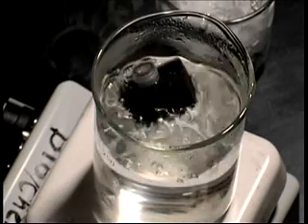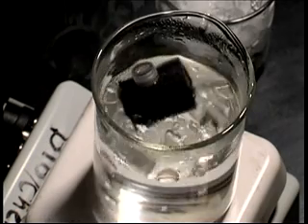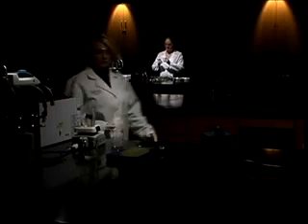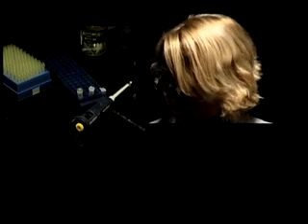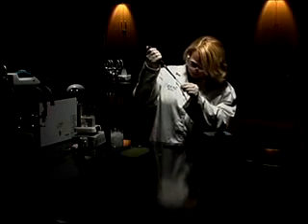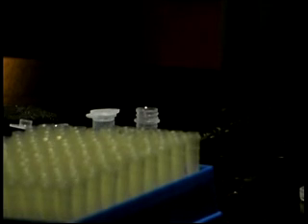Place the tube in a float and boil it for 10 minutes. This will break down the cells, but leave the DNA intact. Cool the tube on ice for 2 minutes, then vortex it for 10 seconds, and let it stand for 3 minutes to allow the chelating agent to settle. Carefully remove 50 microliters of the DNA supernatant to a fresh tube, and ice it until you're prepared for the next step.